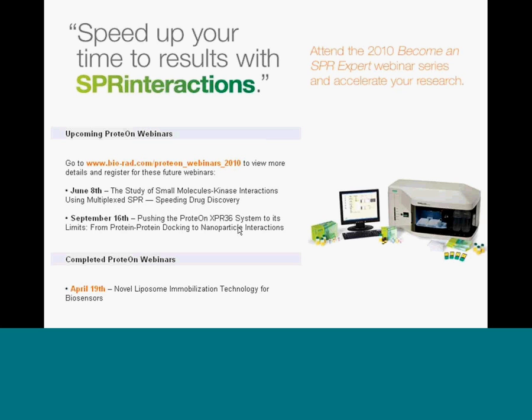Okay. So you've used this method with this kind of calcium-dependent switching mechanism to change the structure of the antibody and then remove the binding effects. Is that something that you think could be applied to, is that a big class of proteins that have that kind of switching mechanism for structure, in terms of calcium binding? The antibody is probably more of a rarity than anything else.